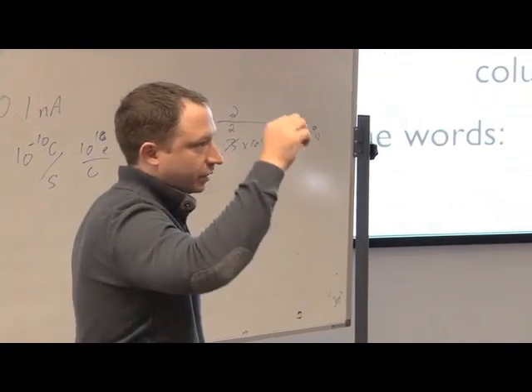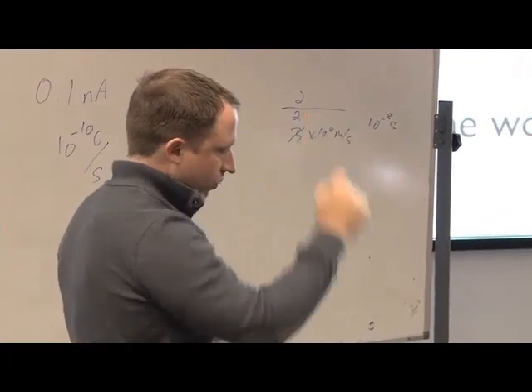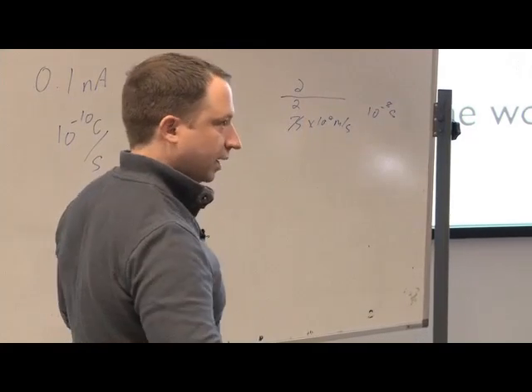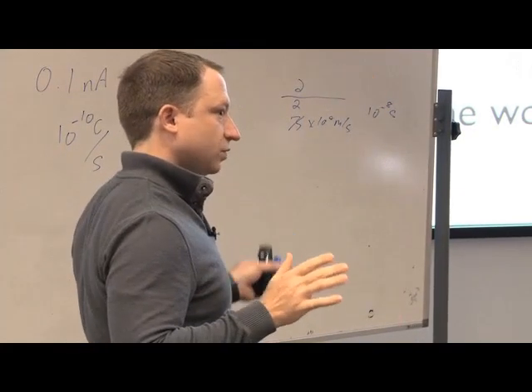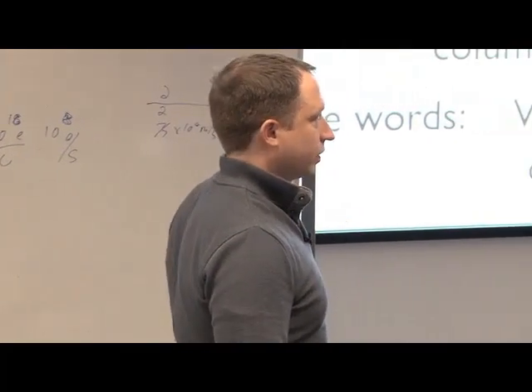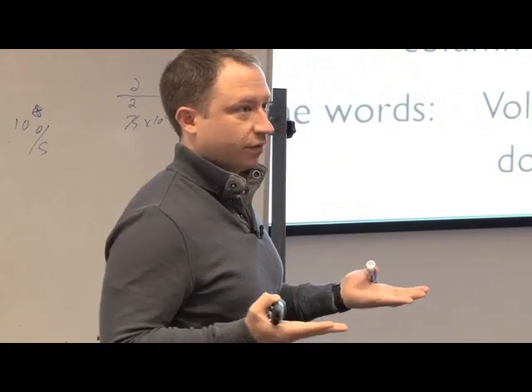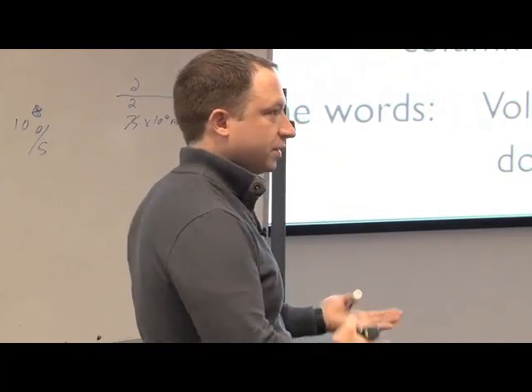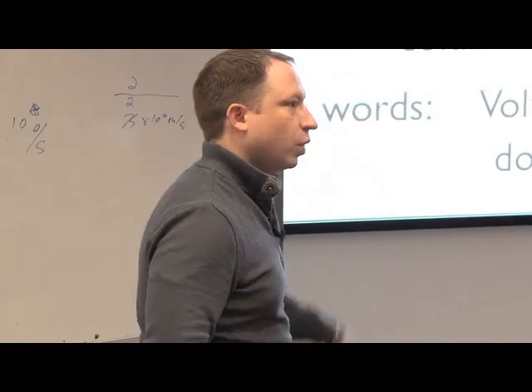So these electrons come off the top, and they shoot down, hit your sample, and hit the detector before the next one is even rolling through. So this is wild. And the reason it's wild is because Shore's just spent an entire lecture explaining to you about how these are waves and how we use them, the waves of each electron interfere with each other, and we use these to make images. But how the heck can they interfere with each other when there's only one in the column at a time?